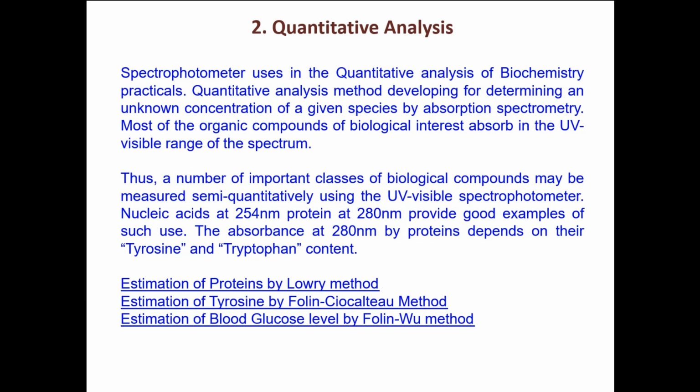So similarly, in enzymatic analysis, we have to be very clear that you always have to link a specific kind of reaction to the enzymatic reaction. It may be the substrate or the product, whose concentration will determine the activity of the particular enzyme. Let's imagine I have an example here.